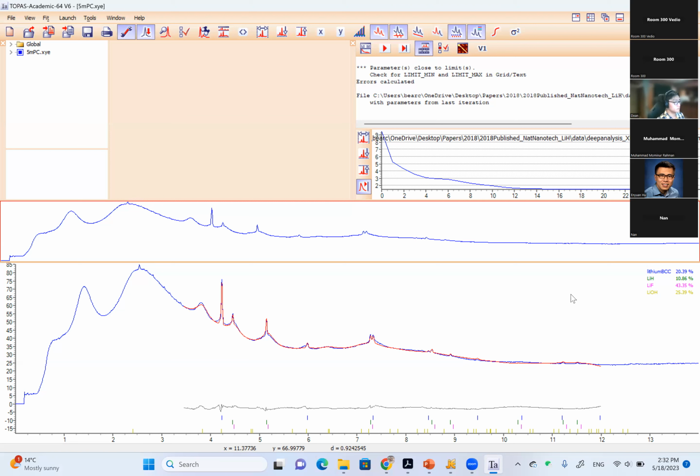Fix your lithium metal capacity at the beginning. And the same may also be true for lithium hydride. So you see the lithium hydride, this one, right? So lithium hydride also has very sharp peaks. And that's the basis of one of our previous discussions.